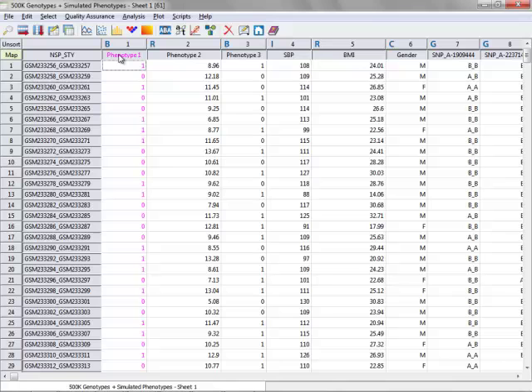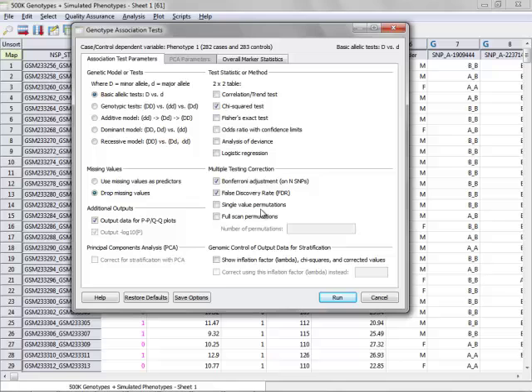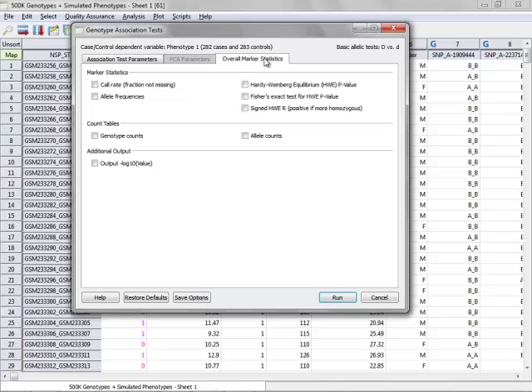Next, go to the analysis menu and select genotype association test. This brings up the genotype association test window, where you can select from a number of genetic models, as well as each model has its various test statistics that you can do. There's other multiple testing corrections, including permutation tests, as well as some various outputs. You can also choose to output marker statistics for every marker as well.